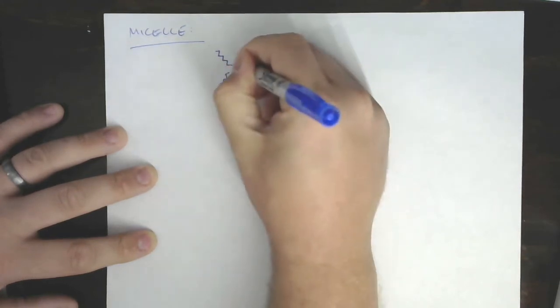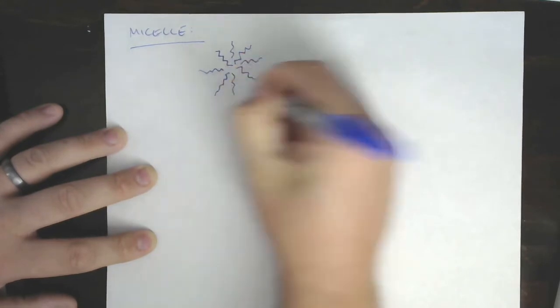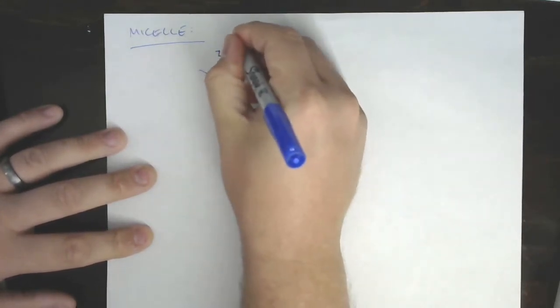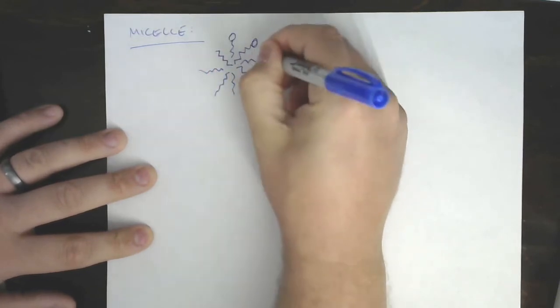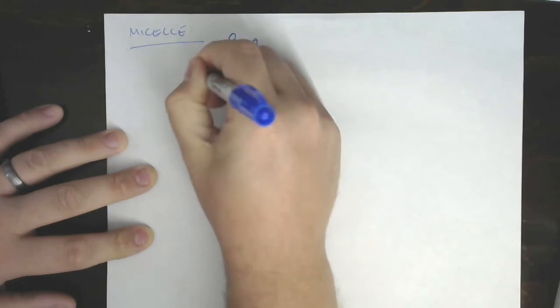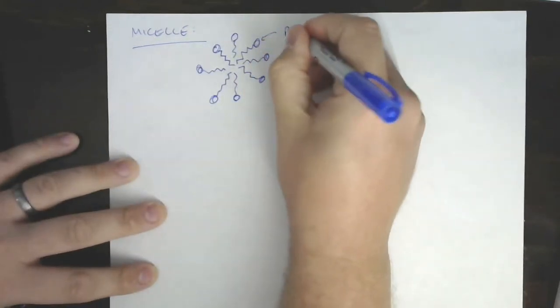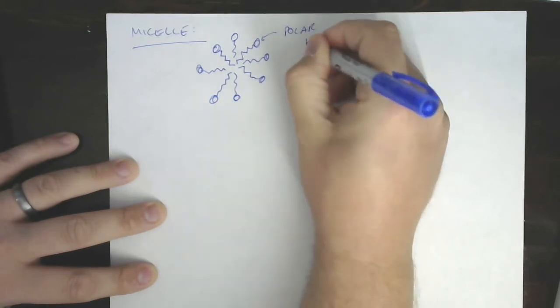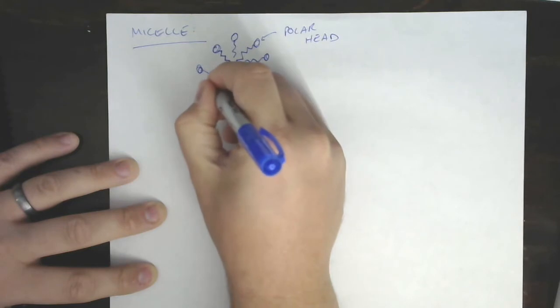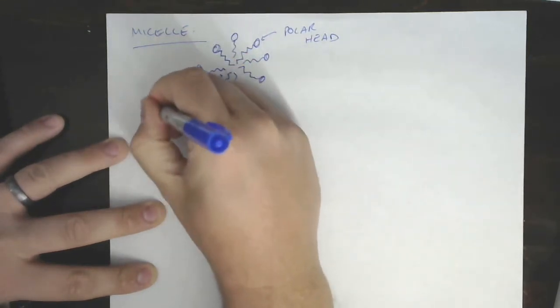They want to interact with each other, not with the aqueous environment around them. So they come together like this. Of course, the polar head groups have no problem being out in the aqueous solution environment, so they're out here. All right, so here's our polar head. And here is our hydrophobic tail.